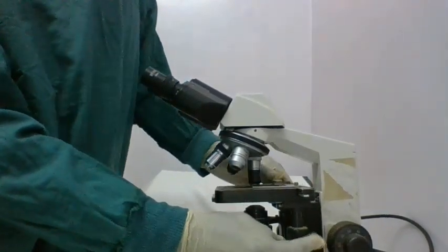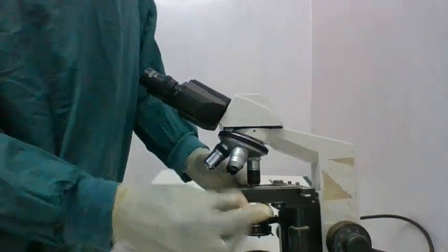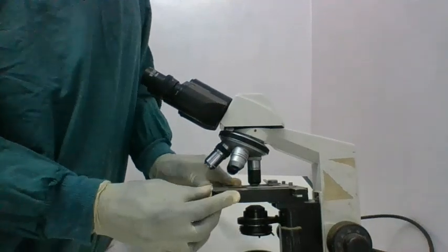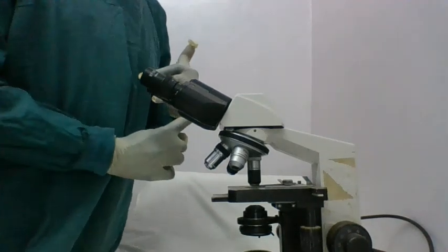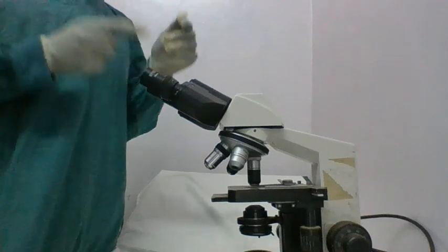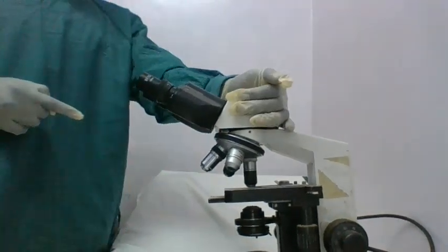Why? So you're there, tensing, you don't even know how to do a fault diagnosis on an instrument. So guys, it's very important that you know fault diagnosis on your instrument and its maintenance. In this episode, as you have seen, I have presented you this microscope.